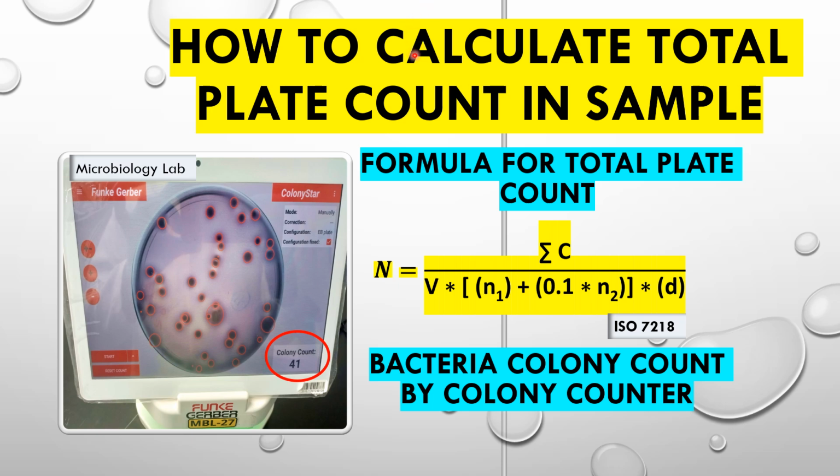Hello. Today our topic is the calculation of total plate counts in microbiological samples. Which formula will we use? This is the formula recommended in ISO 7218.